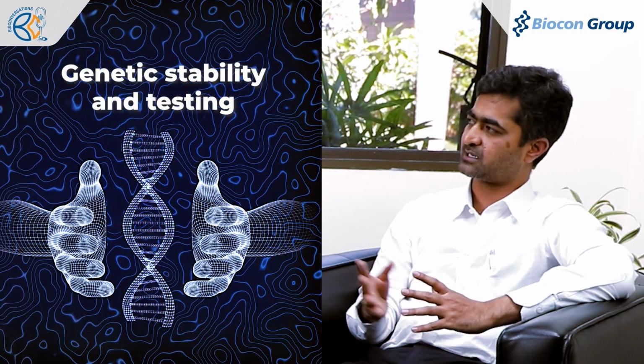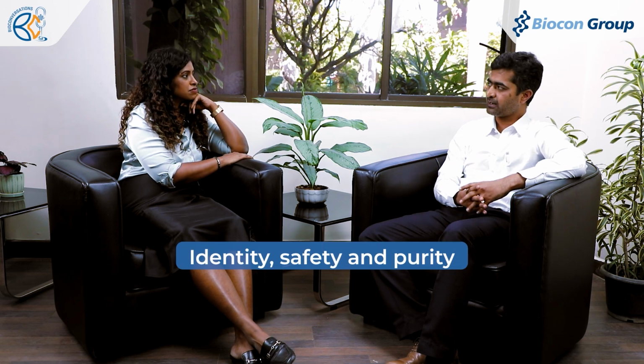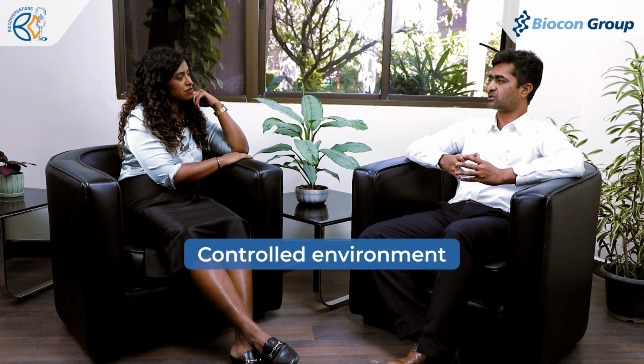After that, to ensure the integrity, several characterization tests will be performed, such as genetic stability and safety, right? Like they have to be free from adventitious viruses and microbes. Right. So identity, safety, and purity is given. And after that, genetic stability essentially ensures that they're stable till the cells are used in the manufacturing processes. Right. So in addition to this, there is storage, where we'll have a controlled and defined condition. All this happens in a GMP environment. So there is a storage facility with criteria which will be looked after.